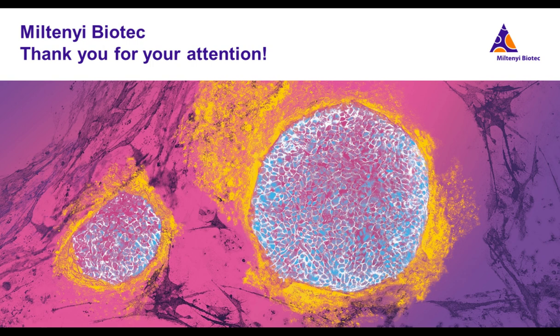Now, how many markers can you view per round? At the moment, the number of markers is 3 per cycle, plus the DAPI signal. But I have to mention that the optical bench, the microscope of the MACSima, is already equipped to cover the entire spectrum.